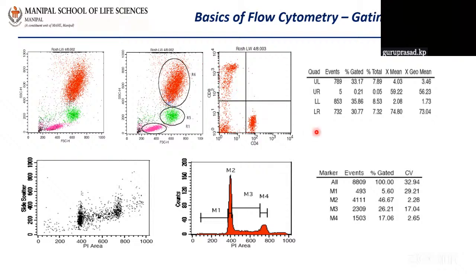This is extensively used for diagnosis, such as, for example, HIV. In HIV, the CD4 cells are continuously destroyed by HIV, and the number of these cells is very low, and this can be used for diagnosis and prognosis of the disease. At the same time, in regular experiments, not only blood cells, you can run any kind of cell and show the number of cells, positive or negative, and their percentage. Everything you will get in about 1 minute, or in about 2-3 minutes when you are analyzing it.